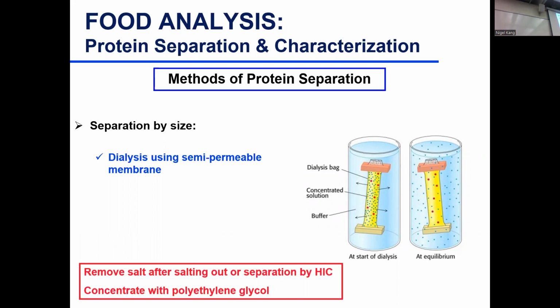So in lab scale, one of its application is when we do protein extraction, we add our protein sample to this dialysis tubing. They have different cutoffs. Usually we use cutoff 1 or 3.5 kilodalton. So what is happening? We have a bucket of deionized water or distilled deionized water. You have your protein sample here. Your protein.